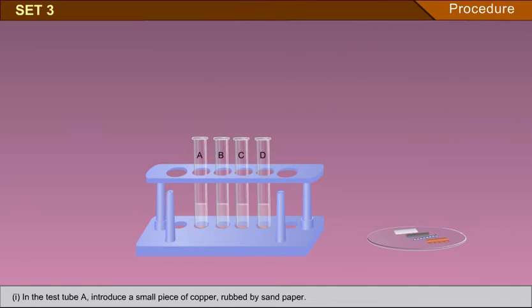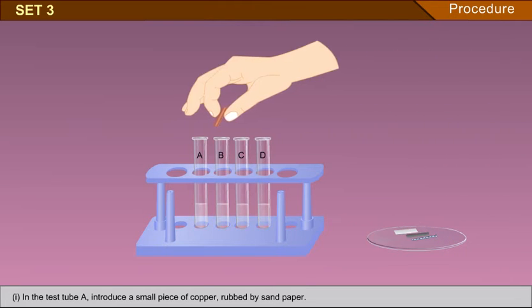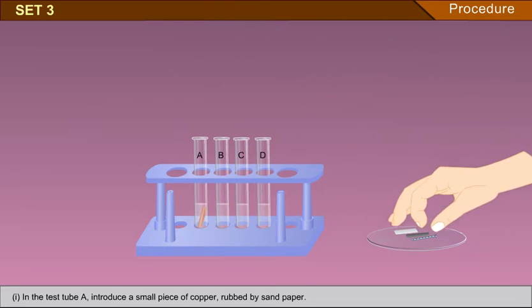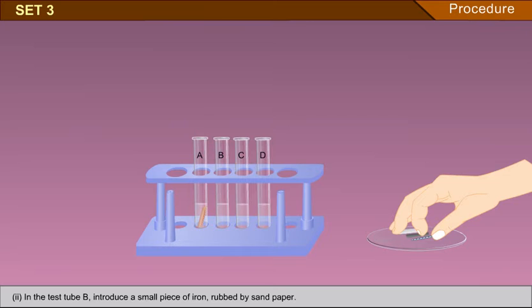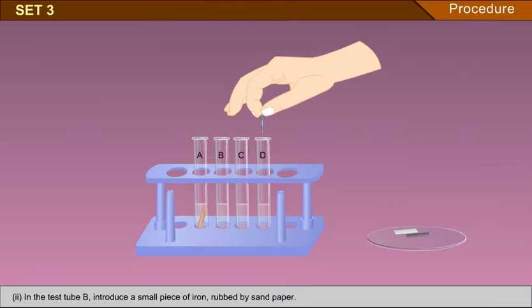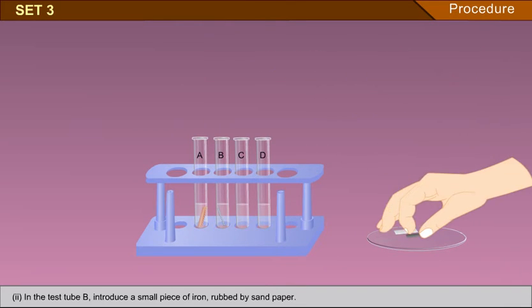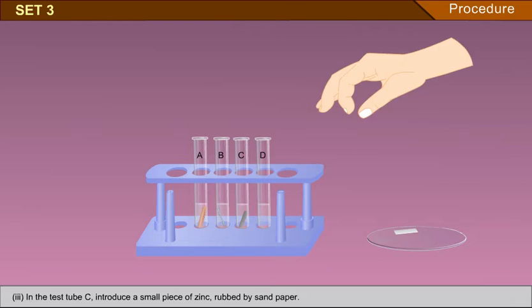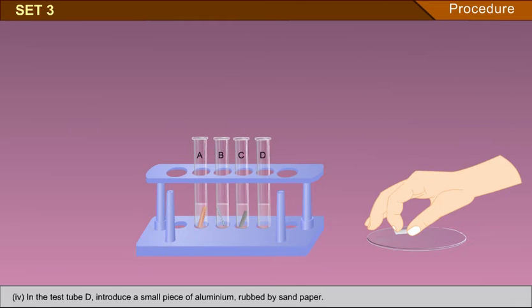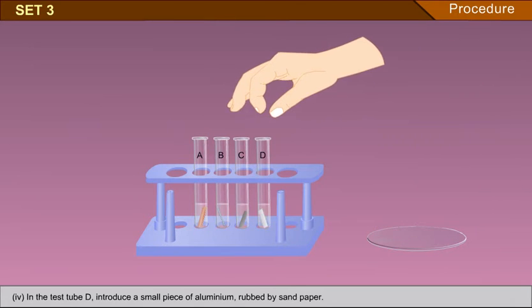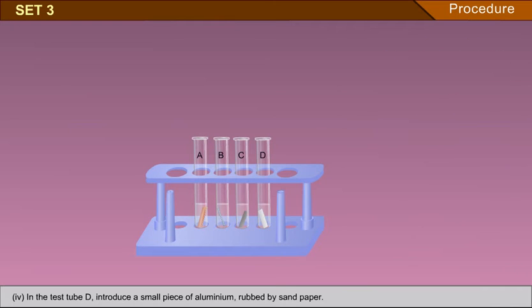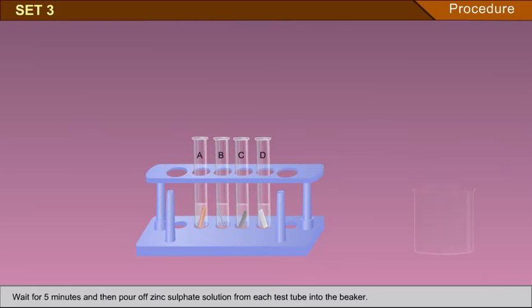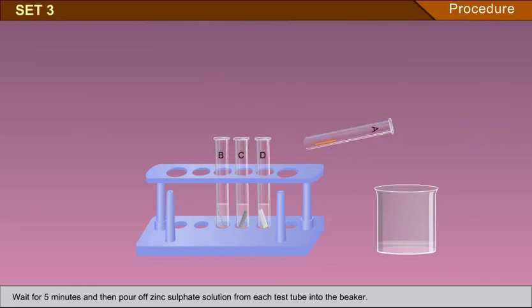In test tube A, introduce a small piece of copper rubbed by sandpaper. In test tube B, introduce a small piece of iron rubbed by sandpaper. In test tube C, introduce a small piece of zinc rubbed by sandpaper. In test tube D, introduce a small piece of aluminium rubbed by sandpaper. Wait for 5 minutes and then pour off zinc sulphate solution from each test tube into the beaker.